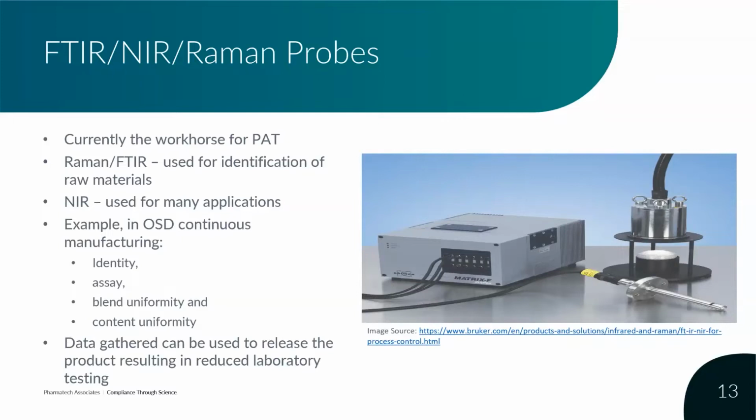These are usually hard sensors that, as I mentioned previously, are used to examine spectral signatures of the different compounds to positively confirm their identity and amount. Also, water has a fairly unique spectral signature, and it's commonly used to determine the water content, as we discussed, how important that was for the wet granulation process.